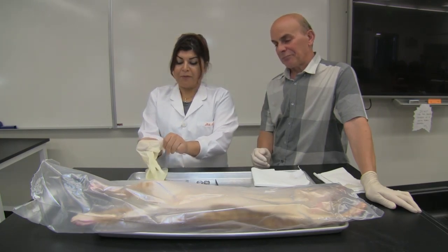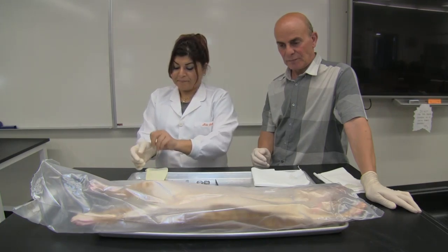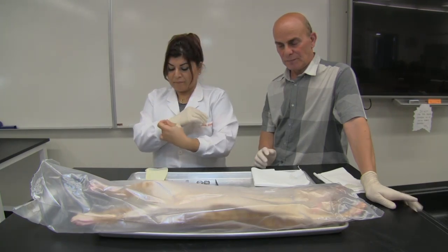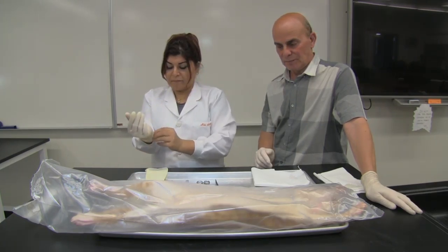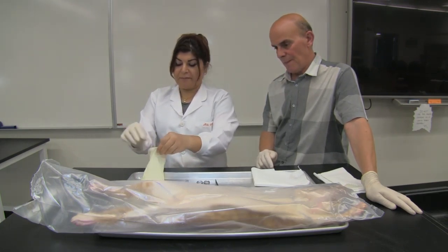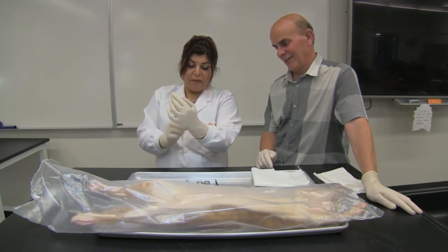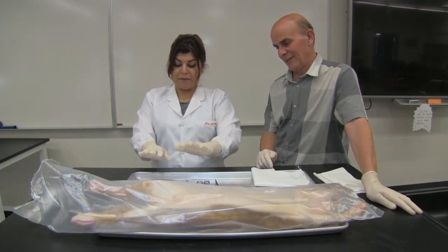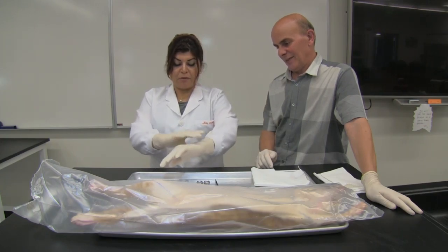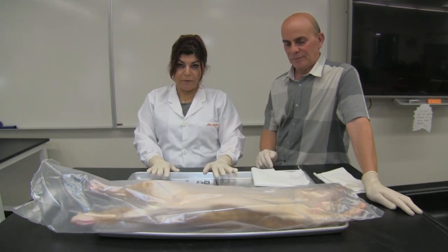Okay, I'm going to put on my gloves, covering my skin as much as I can. It's better not to wear jewelry or a watch, because later you're going to touch your cat and it doesn't smell very good.